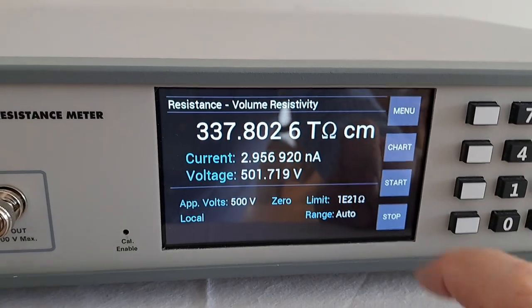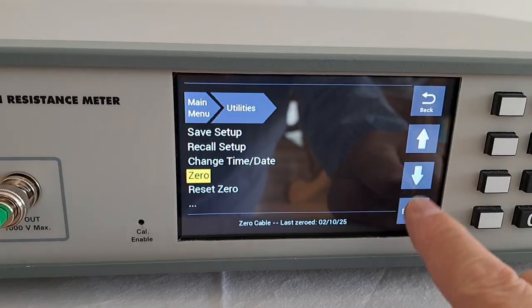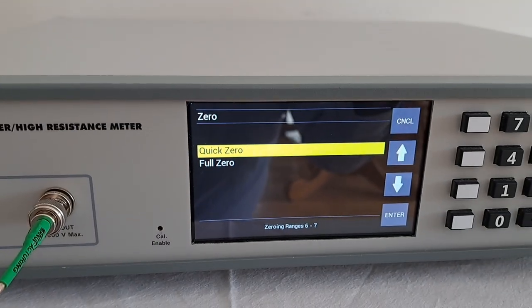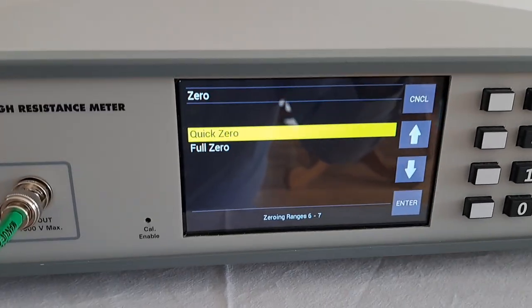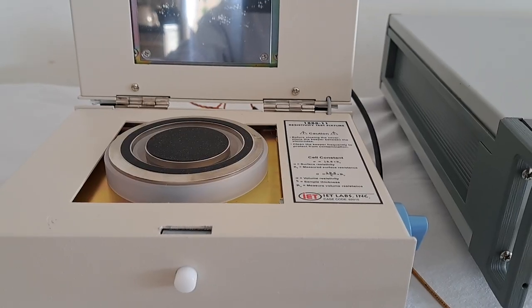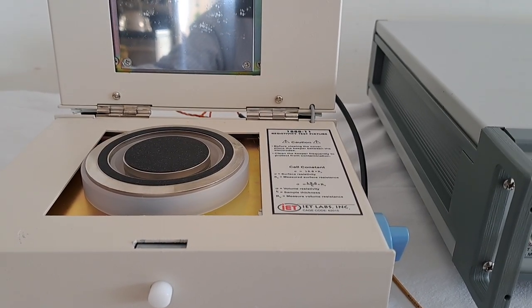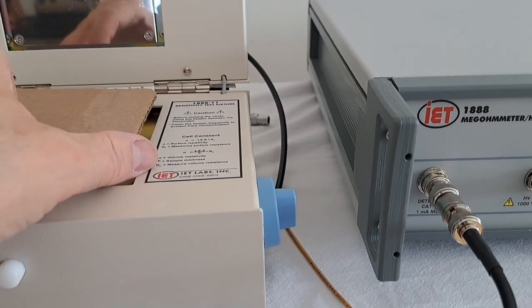Go down, press enter, and enter the thickness of your material in centimeters. Once you've done that, the next step is to go back into the menu, go down to utilities, and perform a zero. Make sure that the cell is open with no material inside — do not close the cell during the zero — then perform the zero. Once the zero is complete, put your material back in.